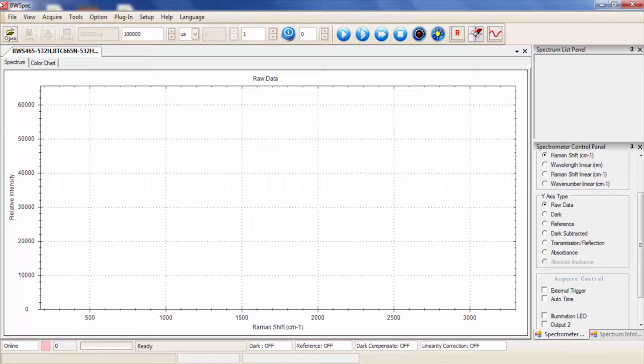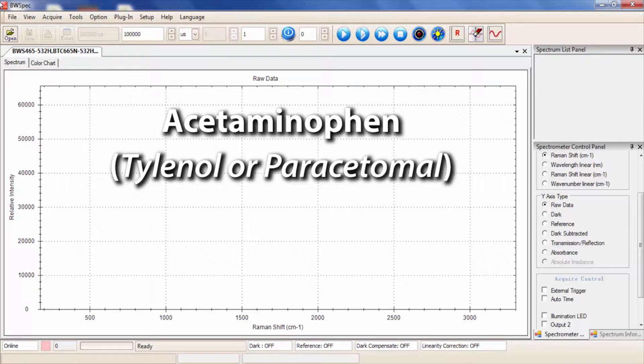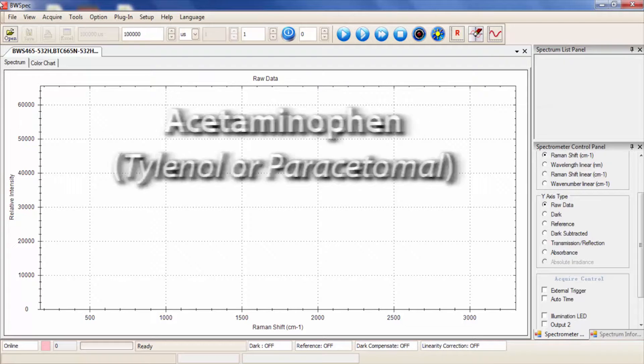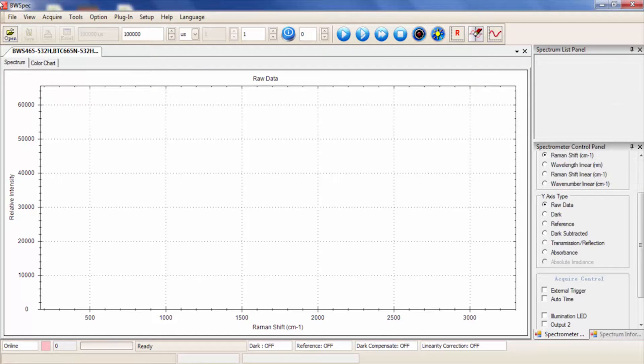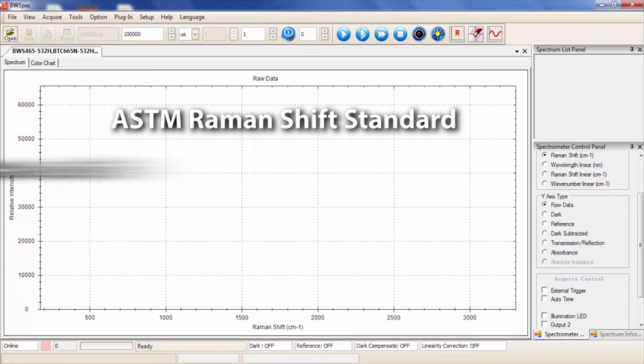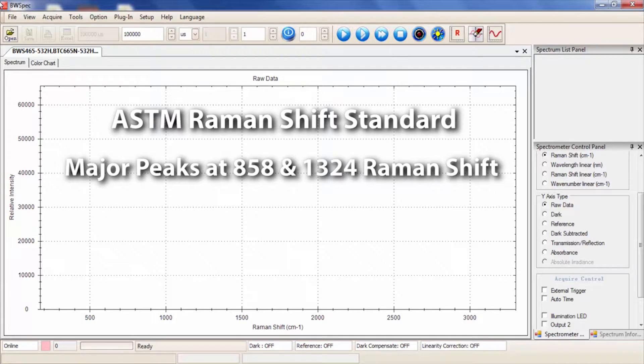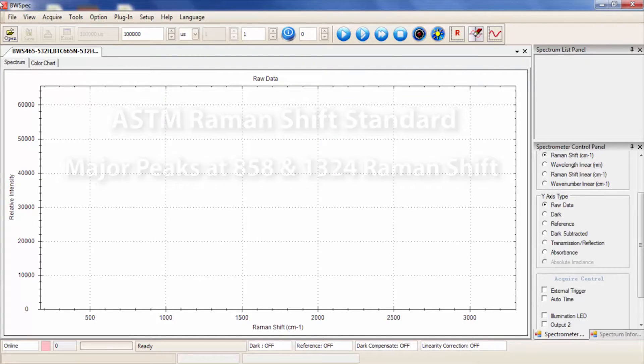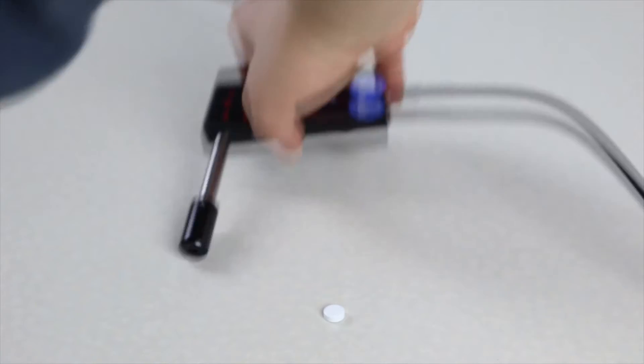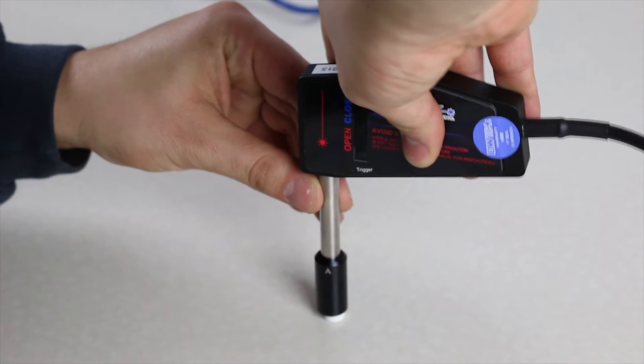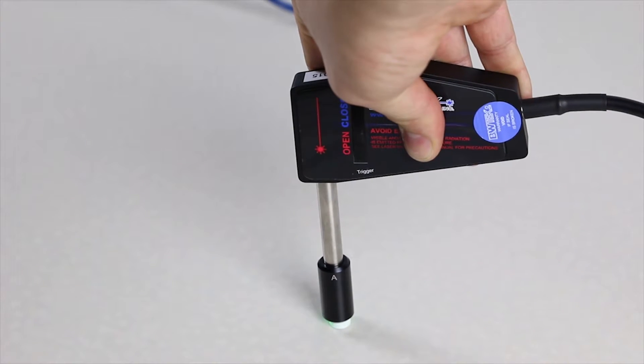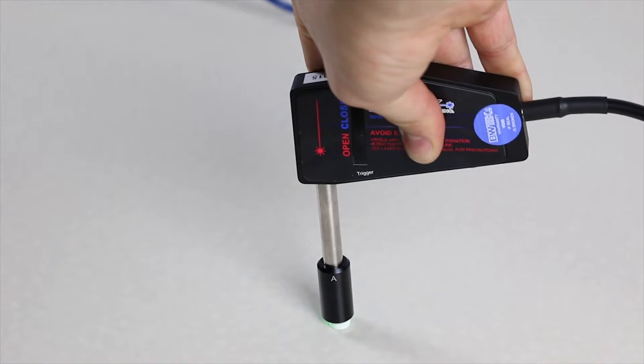On the unit side, we recommend you use acetaminophen tablets. A great example is Tylenol brand tablets, which also goes by the name paracetamol. Acetaminophen gives a great Raman response and is an ASTM Raman shift standard with major peaks at 858 and 1324 Raman shift. Take your probe using the black distance regulator and put it directly onto your tablet sample. Push the shutter into the open position.